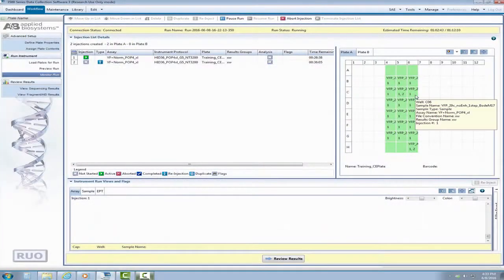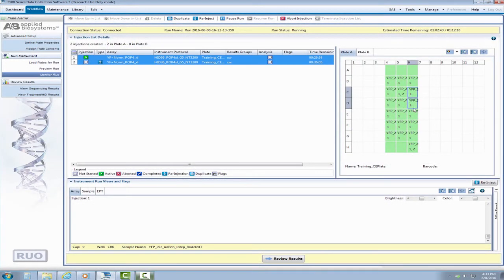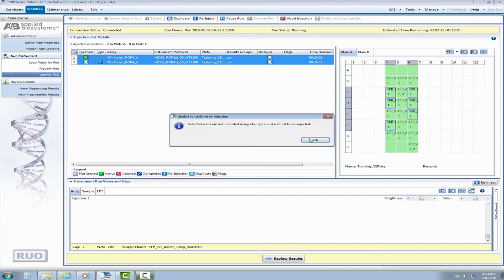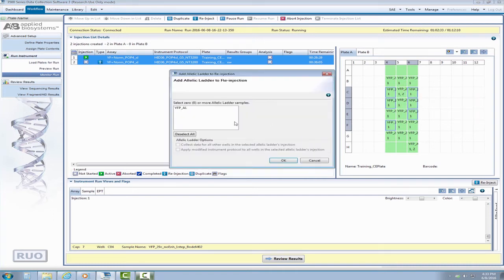Remember that when you specify individual wells for reinjection, the instrument must still physically inject all eight or 24 capillaries for that array. However, the data is collected only for the wells that were selected for reinjection. If you wish to reinject more than one sample, hold down the control key and select each desired sample. This step is essential for consolidating the number of injections it takes for your instrument to perform the required reinjections selected.